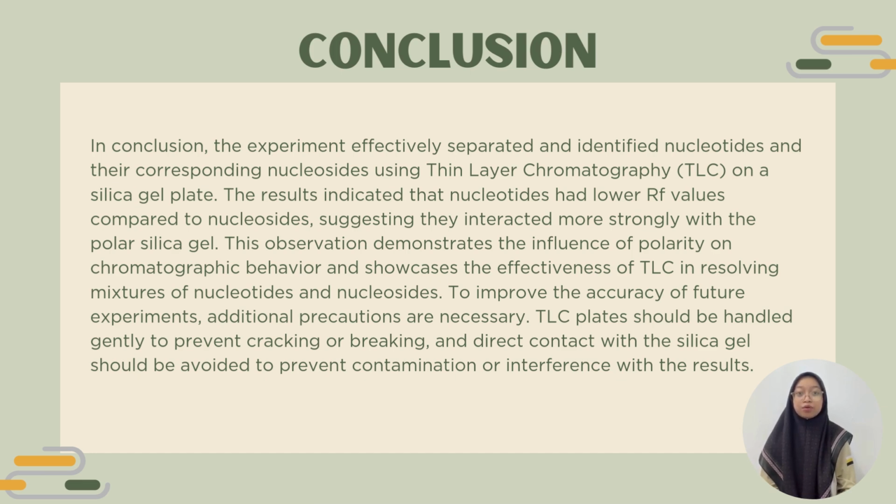The TLC method proved effective in resolving mixtures of nucleotides and nucleosides, helping us distinguish between these two components. However, to improve the accuracy of future experiments, it's essential to take a few precautions. First, TLC plates should be handled gently to avoid cracking or breaking as they are fragile. Second, direct contact with the silica gel should be avoided to prevent contamination or altering its surface, which could interfere with the results. By following these precautions, we can ensure more reliable and accurate chromatographic results in future experiments.